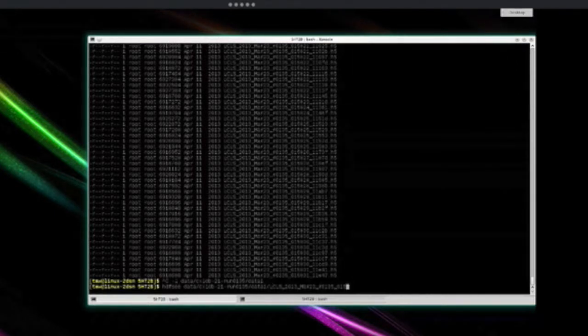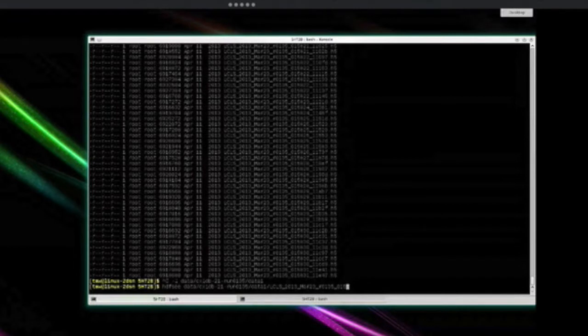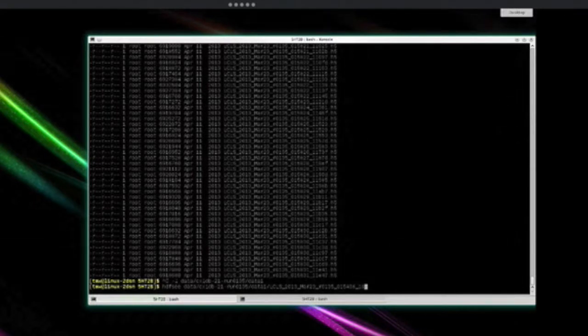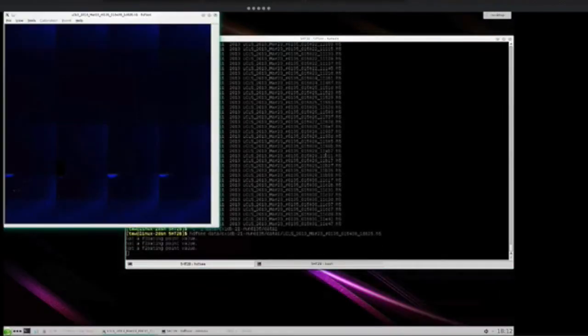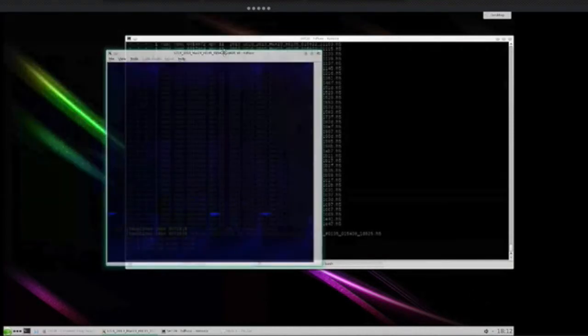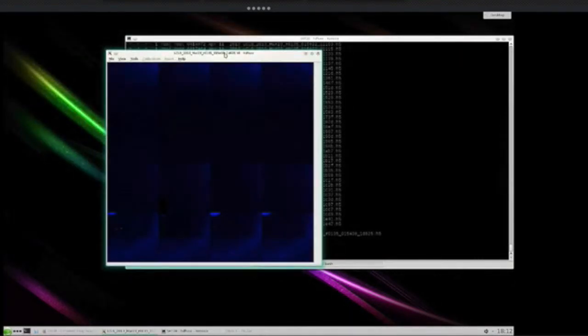Tab, okay, 1, 3. So let's choose a random file. So let's try 6, 5. Okay, so there's a random file. If I open that, the first thing you notice is that the panels of the detector are in the wrong places. This detector, the one used at the facility where this was taken, has many small panels, and you can see the edges here, these little squares, these rectangles.